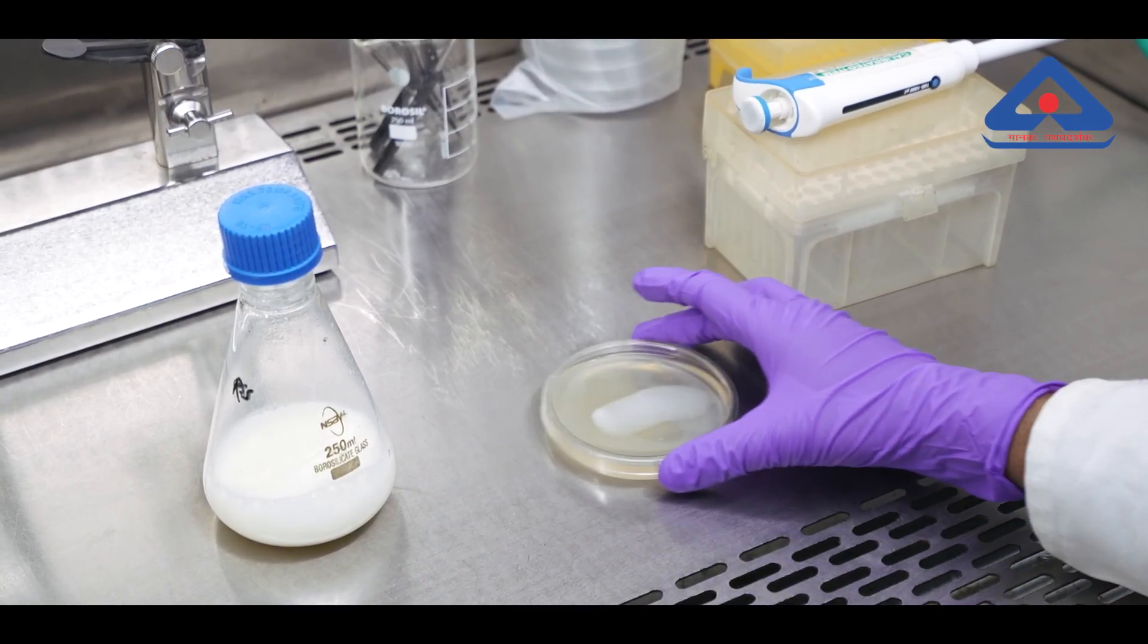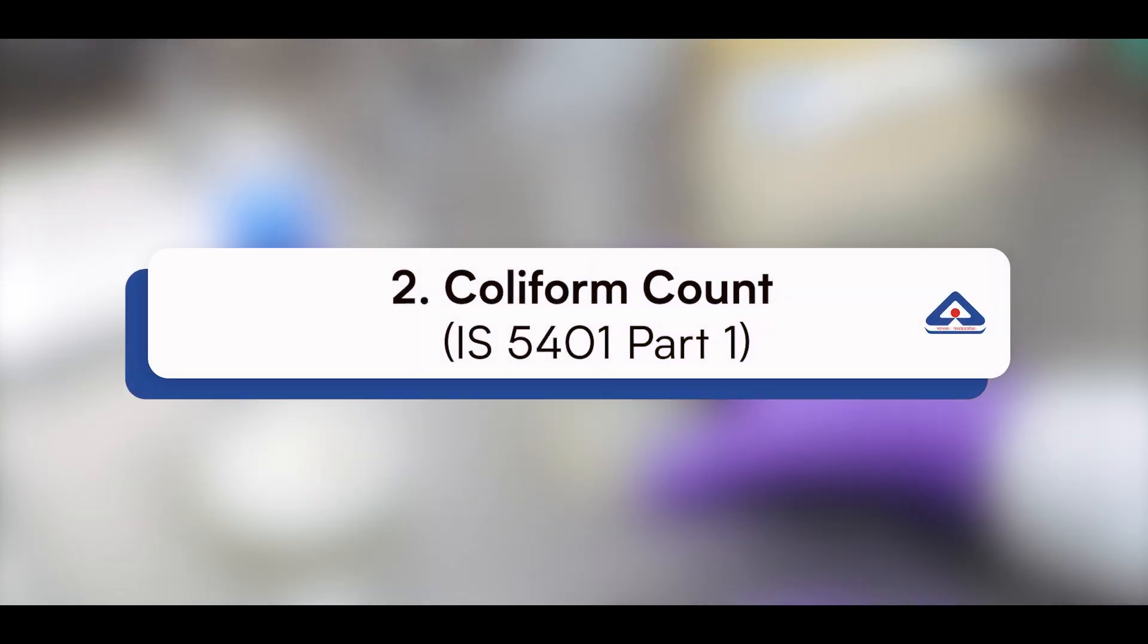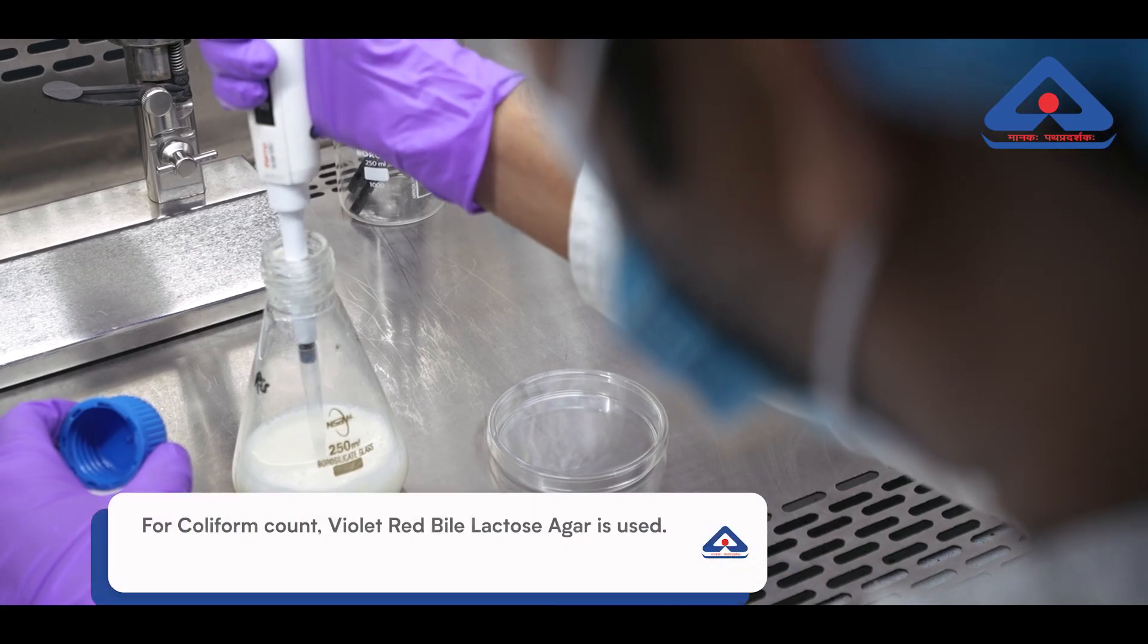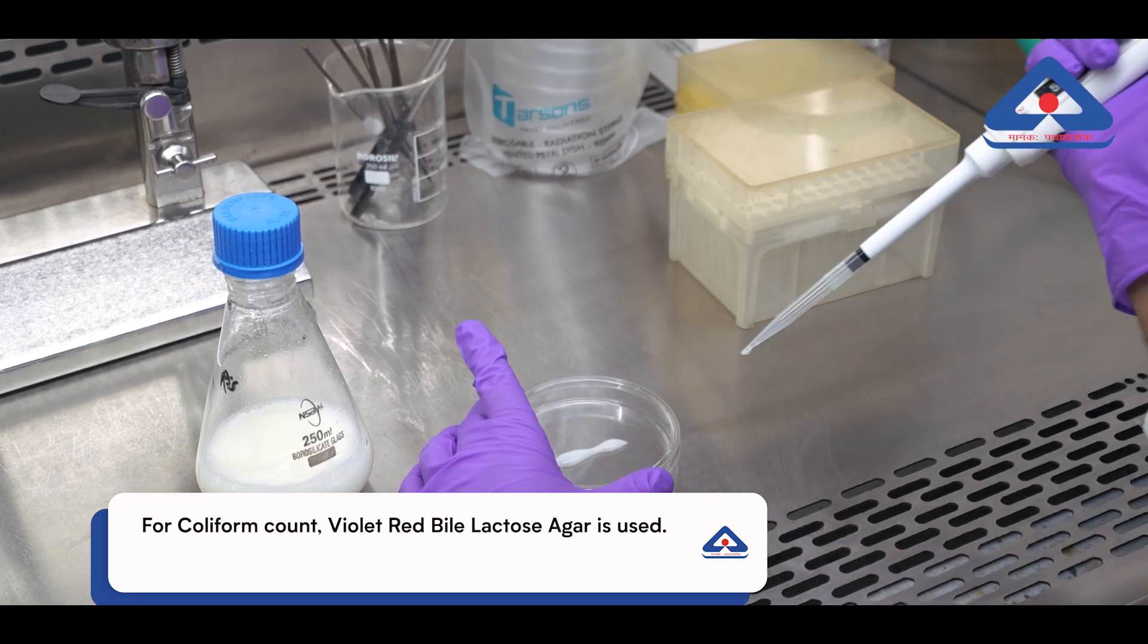Number two: Coliform count, IS 5401 part 1. Coliform count helps us identify bacteria that could indicate contamination, ensuring the powder is produced in clean conditions.